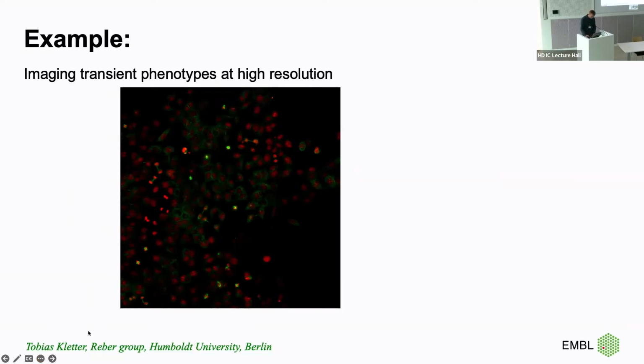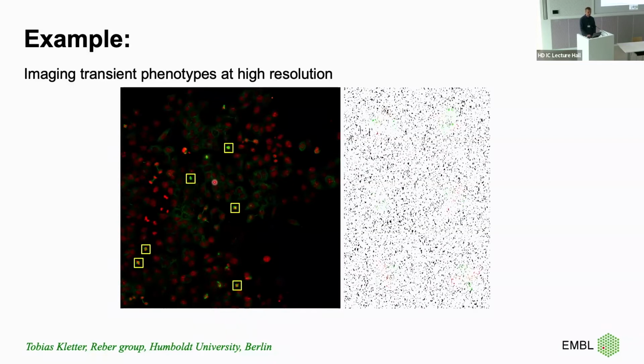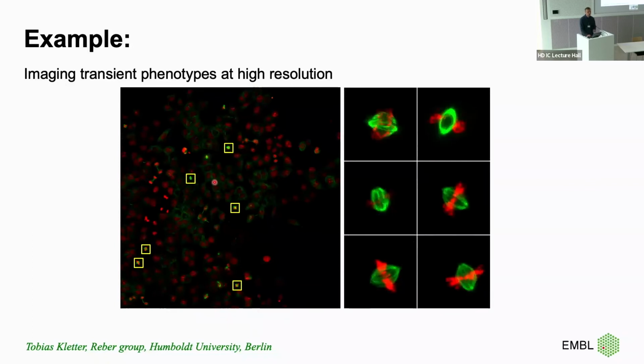And then we need to spot the cells. And let's imagine that it's also a live sample, right? And we want to track the cells, and we want to do it as fast as possible. So the user would need to acquire this image, find and mark these positions, switch to other settings, and then finally trigger the acquisition, which will bring him to that type of example, right? So that's how it's meant to be. And this is, in the simplest case, what you would imagine: a low resolution and a high resolution image.